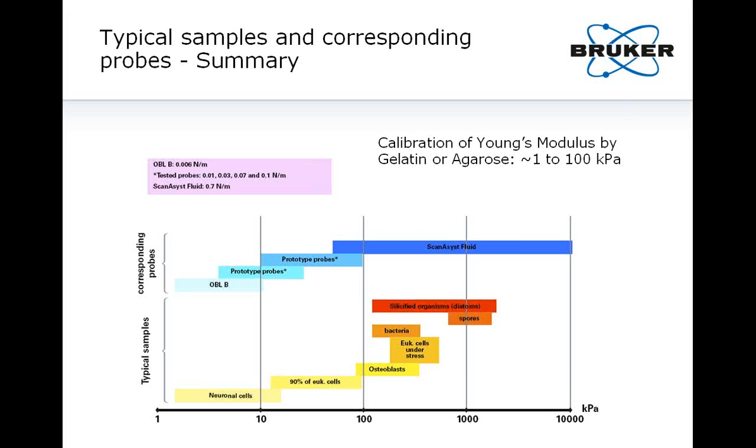I have to say that the technique is not perfect, and to be fully quantitative, especially on super soft cells, we might have to design new probes with a low spring constant and a larger tip radius to have a better distribution of the force and a better control on the loading force. The key to success for this type of experiments is really the quality of the force curves, which is mainly obtained by working on the PeakForce set point and also the scan rate. Typically, if you want really good force curves, you should scan pretty slow. If you want additional information on the scanning parameters, just let me know. I'll be happy to help out.